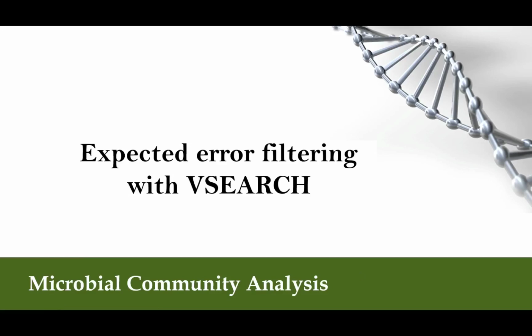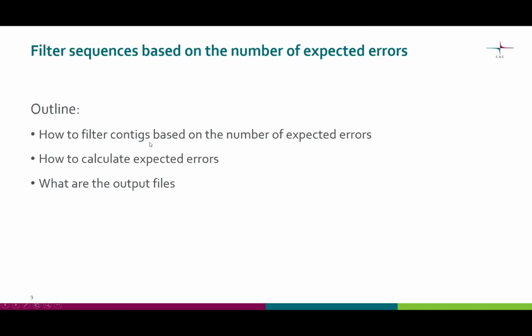In this video, we discuss how to filter contigs made by VSEARCH based on the expected number of errors. So you will learn how to filter contigs, how the expected errors are calculated, and what the output files are.